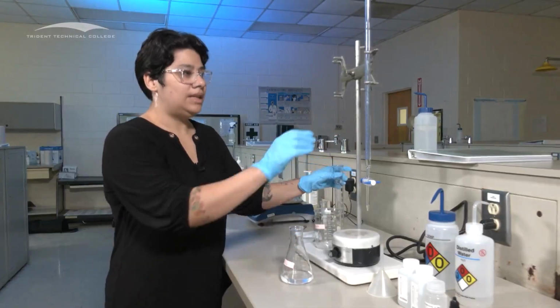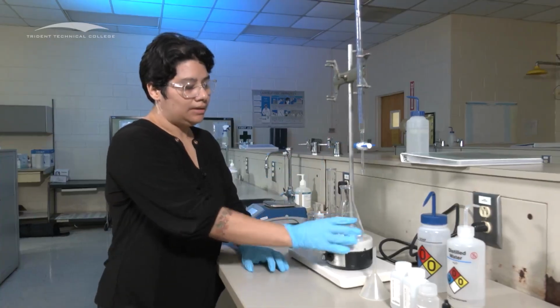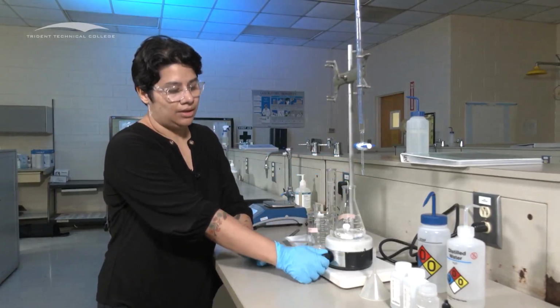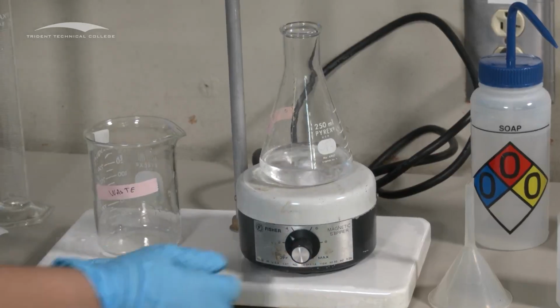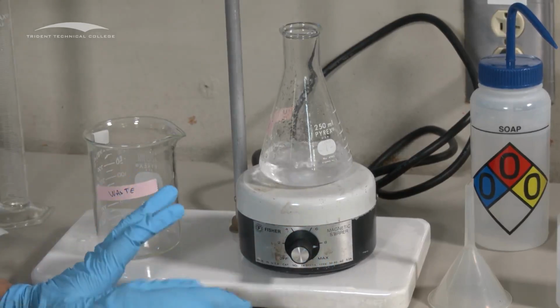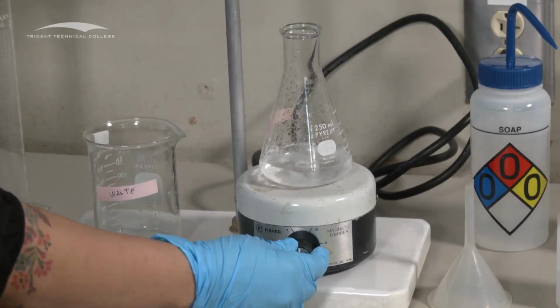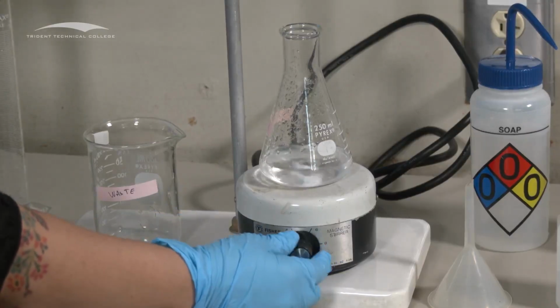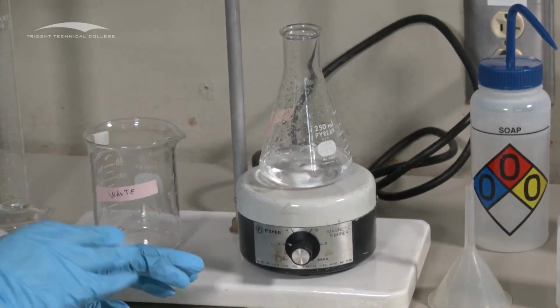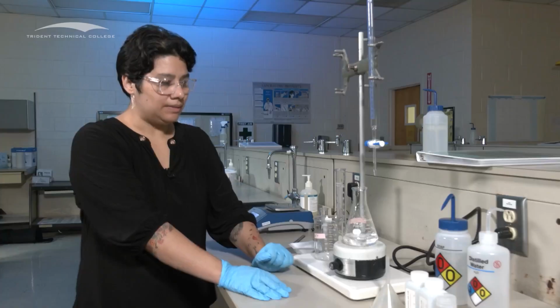And then to dissolve this, you are going to put it on top of the magnetic stirrer, and then you're going to turn on your magnetic stirrer like so. Now, a couple of things. If this is splashing everywhere, notice how this is splashing everywhere, this is not good. You don't want to do this because you're going to lose some solution. Some of it is not going to react. The ideal speed, so this is also really, really slow. So your ideal speed is about this much. It's still fast enough that it is dissolving, but not too fast that it's splashing everywhere. Ideally, that's not what you want.